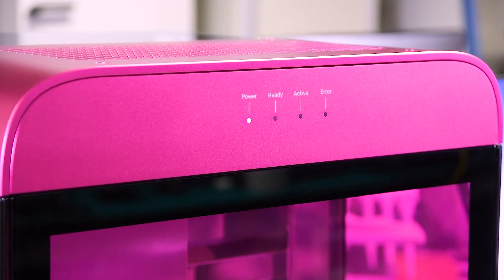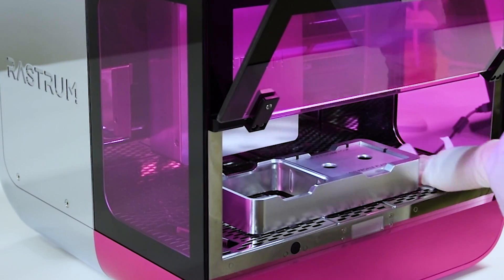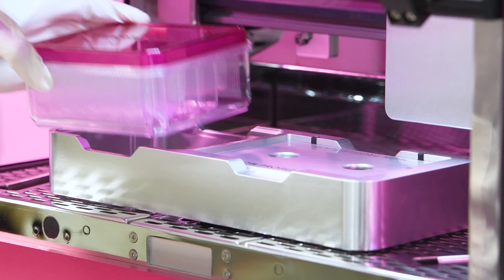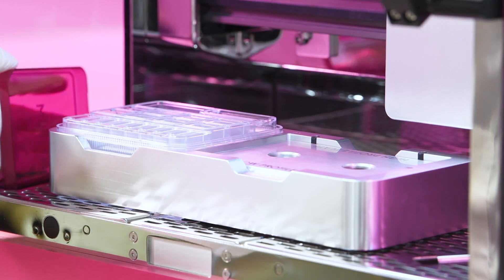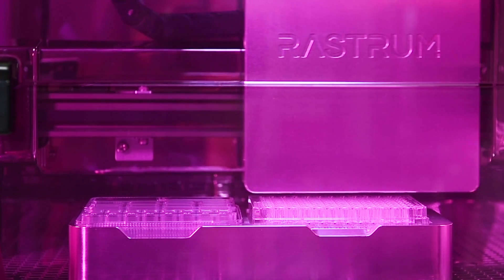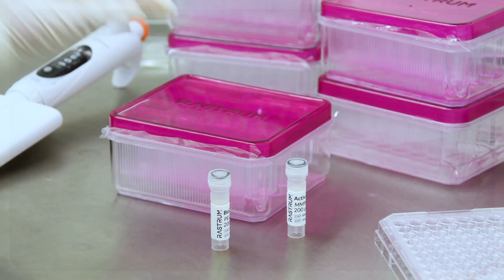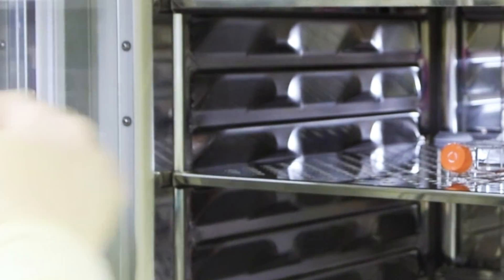Start your experiment by turning on the printer and wiping the internal surfaces with 70% ethanol for sterility. Place the Rastrum cartridge filled with cleaning reagents into the slot to start the initial clean, which automatically flushes the fluid lines at the printhead. During the printer cleaning phase, thaw the Rastrum inks at room temperature and harvest the cells for printing using standard protocols.